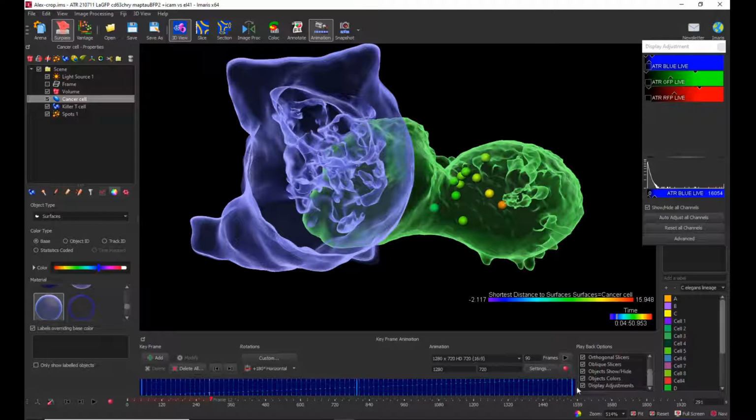Also, one hint for creating your movies: sometimes it's better to avoid too many frames or too long movies with too many actions, because then it's really hard to remember what was going on where and hard to modify the actions. Then some of the transitions go too fast, so sometimes it's better to create 2 movies and play them one after another than to create one too long movie of your dataset.